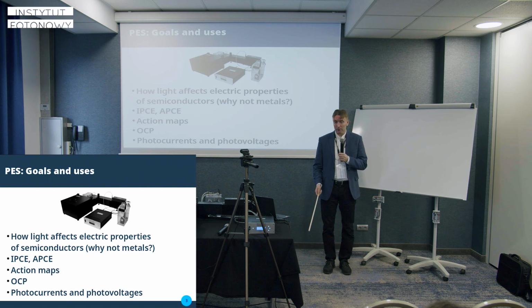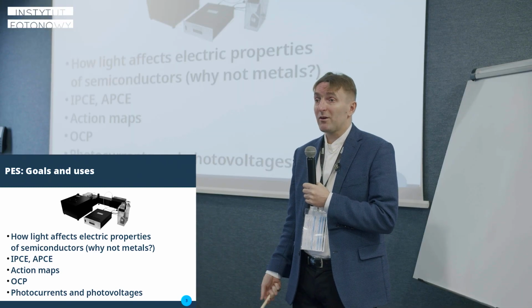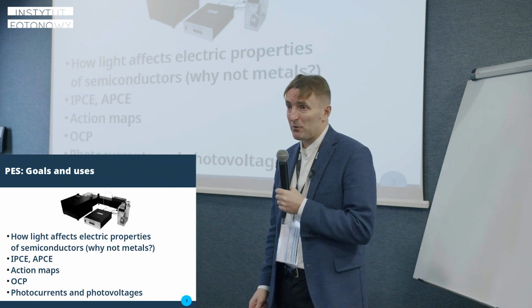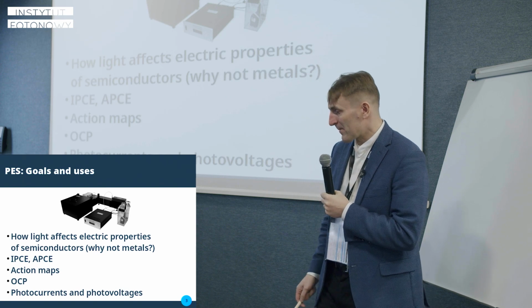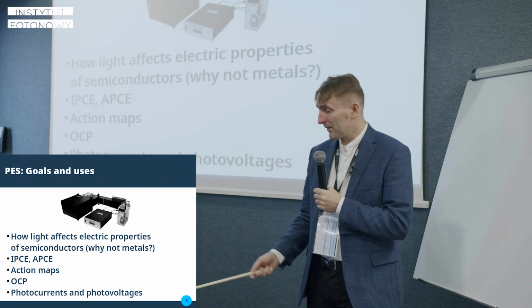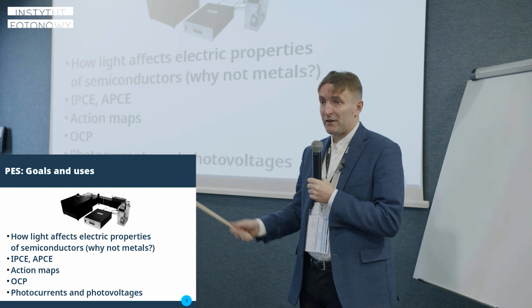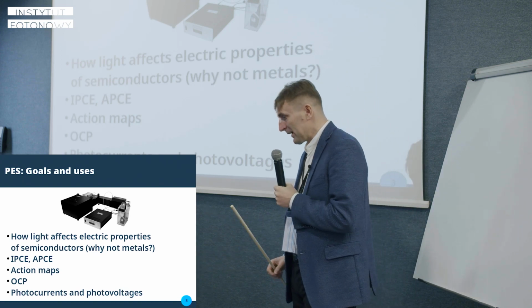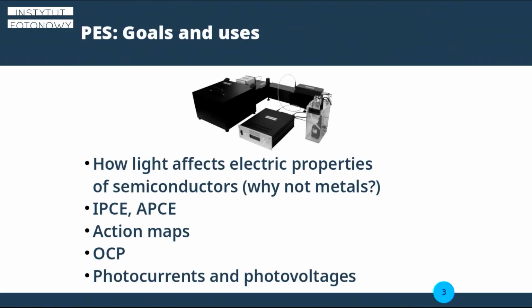Quantities that you can measure are external quantum efficiency, so this is IPCE. I will talk about it on one slide at the end. APCE, so this is absorbed photon to current efficiency, or internal quantum efficiency. Action maps, open circuit potentials, generally photocurrents and photovoltages.